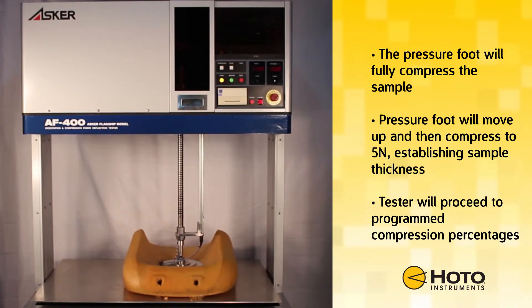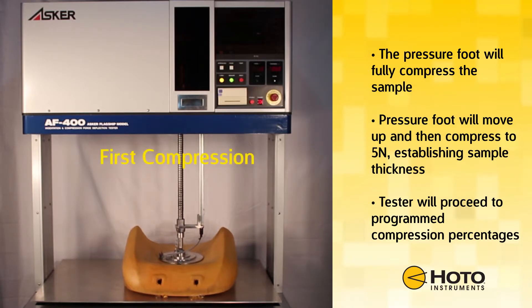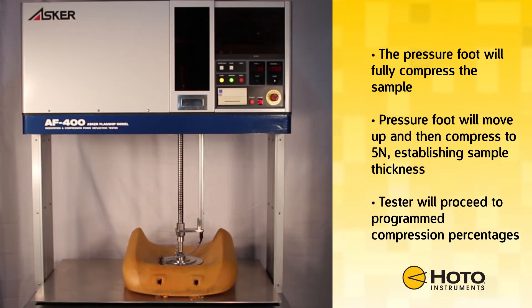First, the pressure foot will fully compress the sample. The pressure foot will then move back up and compress to five newtons, establishing sample thickness. The tester will then proceed to the programmed compression percentages, recording force and displacement readings for each set point.